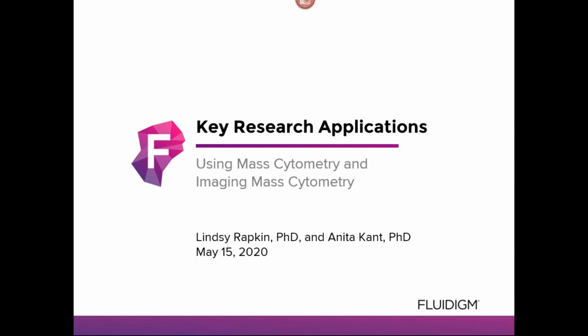So first, we would like to discuss how mass cytometry and imaging mass cytometry are leveraged in many key research areas.